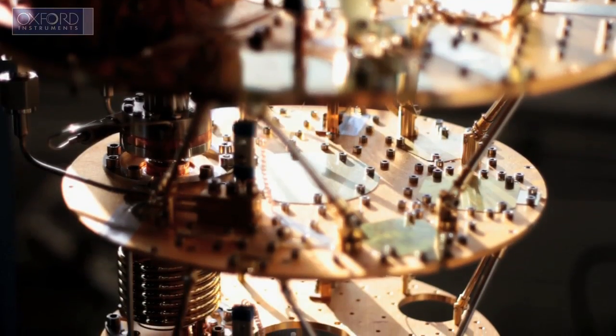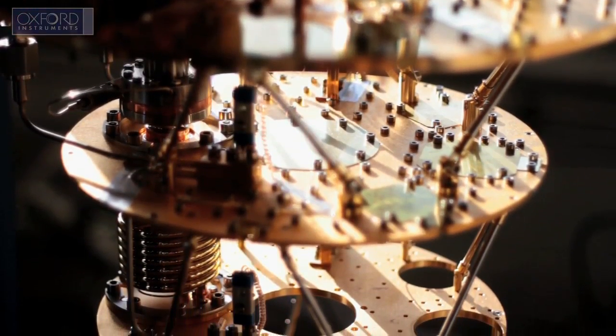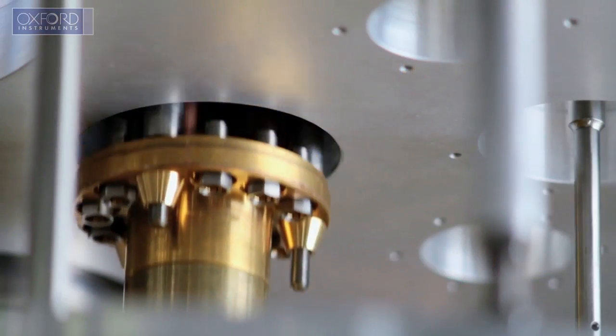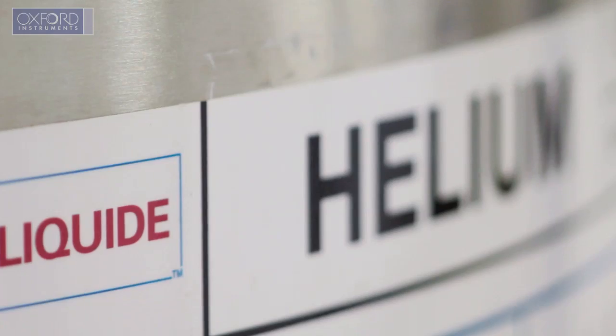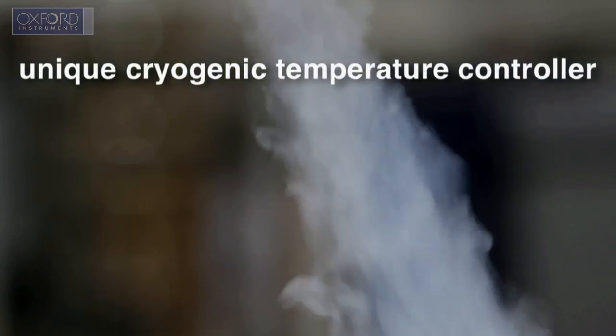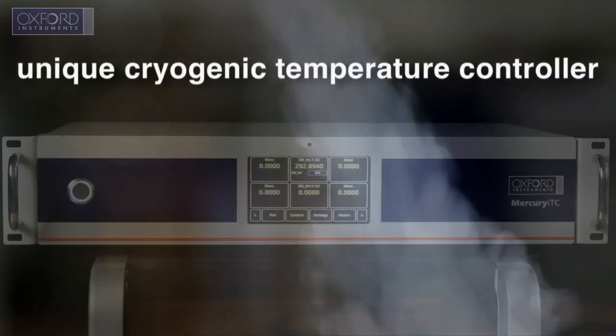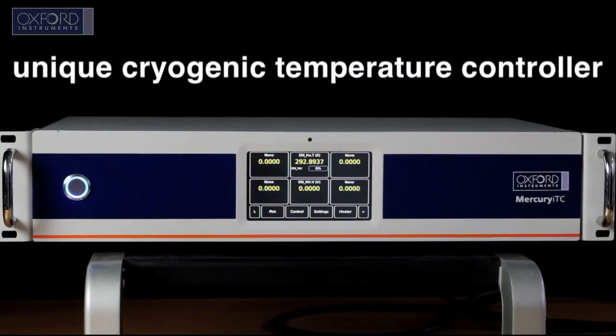Oxford Instruments Nanoscience is the world leader in the supply of high-field superconducting magnets and cryogenic systems. We have developed a unique cryogenic temperature controller, the Mercury ITC.